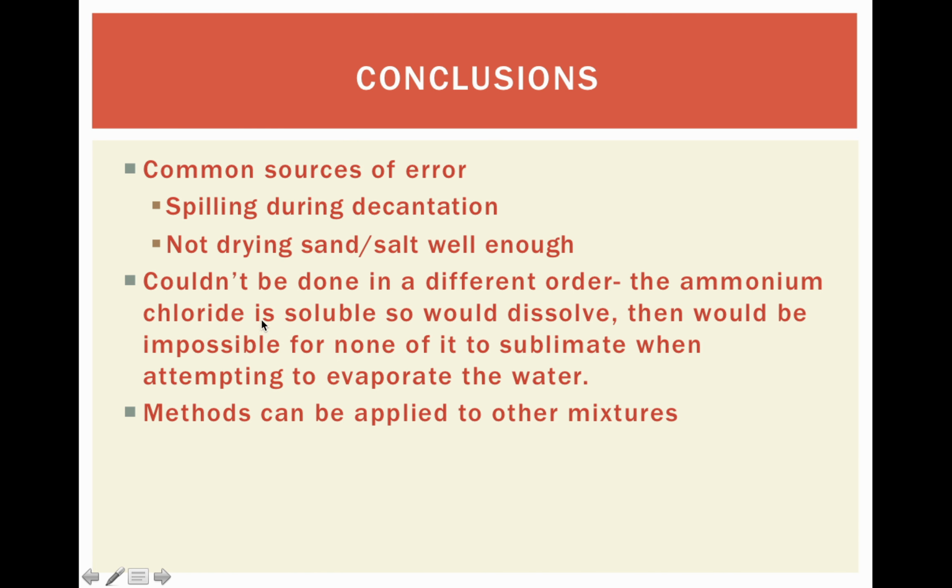Some common sources of error in this lab were that we had some spilling during decantation, which led to lower percentages than to be expected. Or if you got higher percentages, it was because of not drying the sand or the salt well enough. In looking back, it really couldn't have been done in a different order. The ammonium chloride would dissolve, but then it would be impossible to sublimate it while evaporating the water and have those two processes be separate.